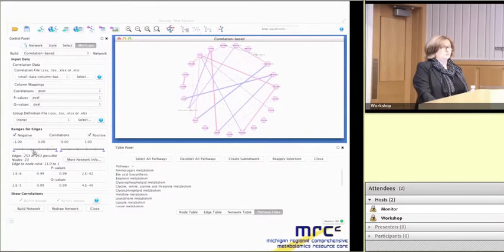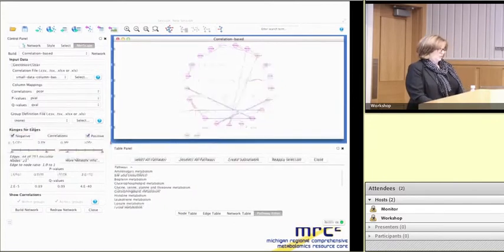If it would be a live demo, since it's an early version, we just didn't feel that we were ready to give a live demo of that. But I would be adjusting the sliders right here. And when I adjust that, it keeps the most significant correlations, these edges that were thicker. So that's basically how it works.